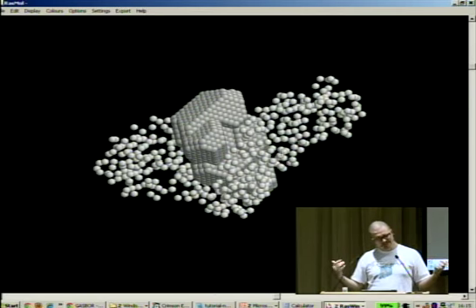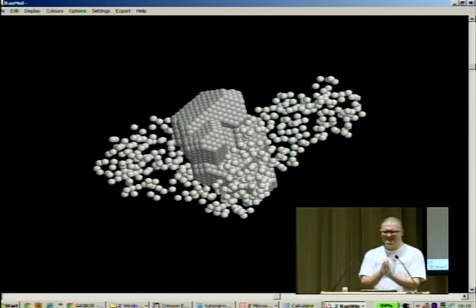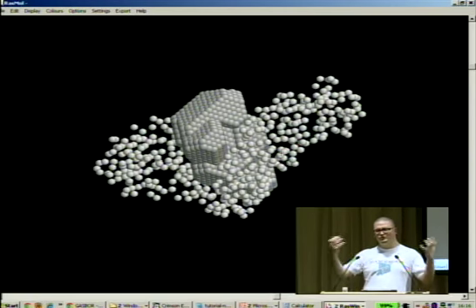So this is common sense that you always need to remember to apply to the questions that you would like to get answered using small angle scattering. And I must say this is very important. Before you do any modeling, I think in any structural biology, you need to ask yourself, what is the question I would like to answer? Because typically people come to us and say, I want to know the structure of this protein. And it's like, yeah, go crystallize it. I cannot crystallize it. Give me the structure.